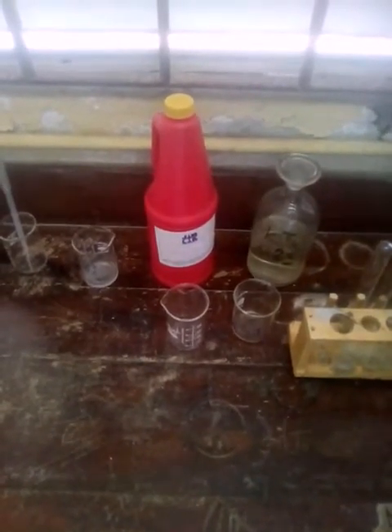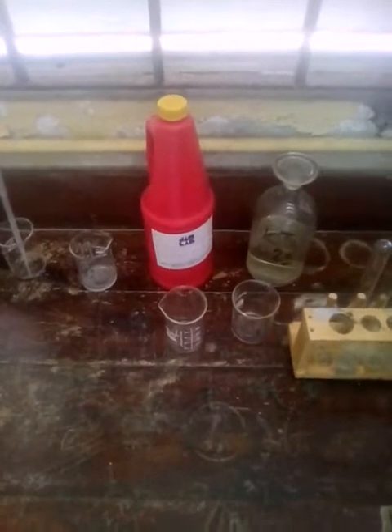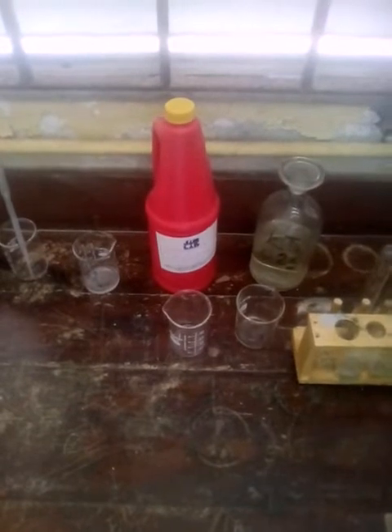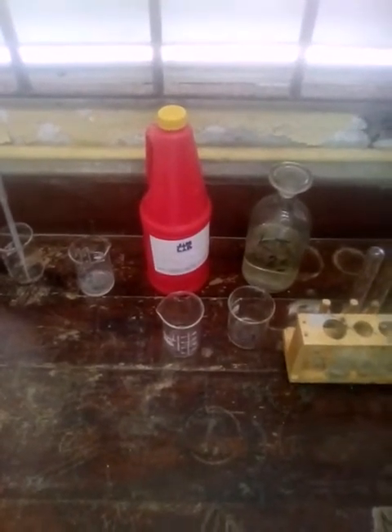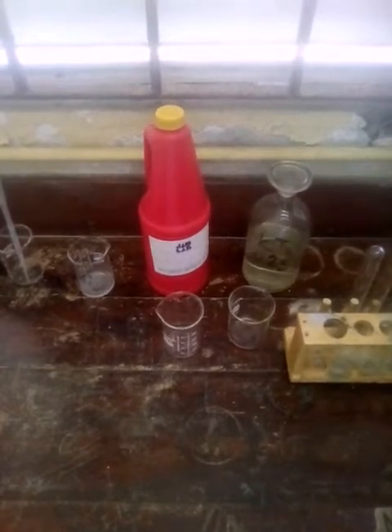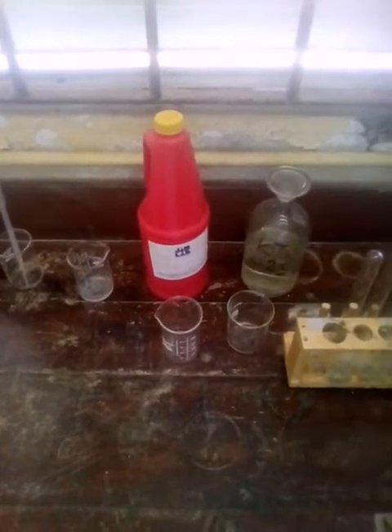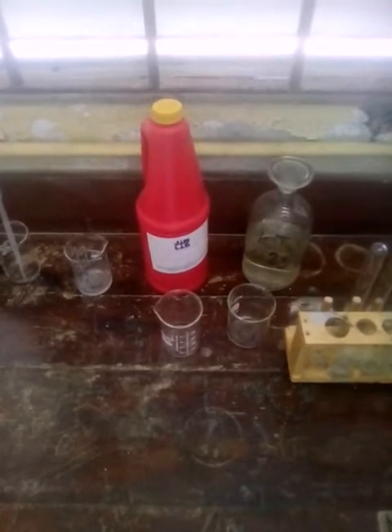As I said before, we'll be using potassium iodide and hydrogen peroxide, and we'll also be using a small portion of dilute sulfuric acid because, as you should know by now, redox reactions occur much more effectively in an acidic environment.